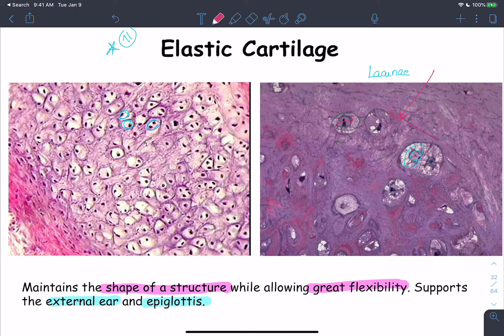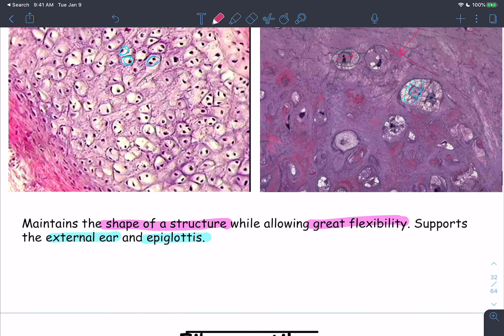A cartilage with elastic fibers is the elastic cartilage. Elastic cartilage maintains the shape of structures such as the ear pinna and epiglottis while providing them with great flexibility.